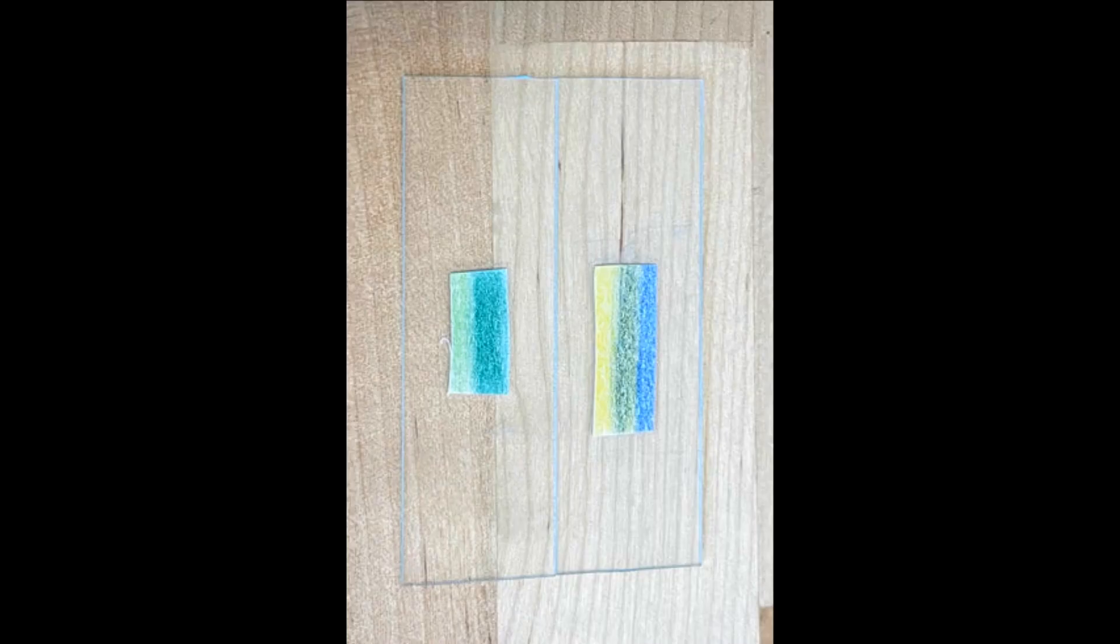Green objects under a Foldscope. The difference between solid green and green created by mixing primary colors might not look that different to the naked eye, but when you peer deep into the microscopic level, it is easy to tell which is which. Let's start with colored pencils. This figure shows a piece of paper colored in with two different shades of green colored pencils.